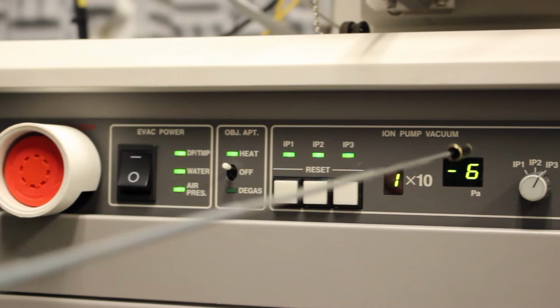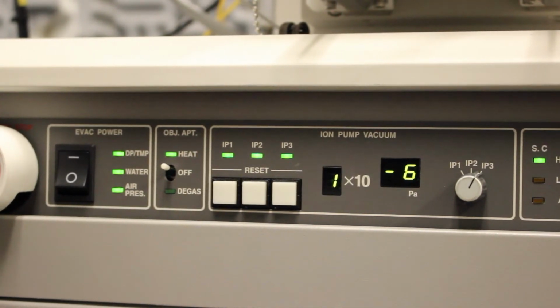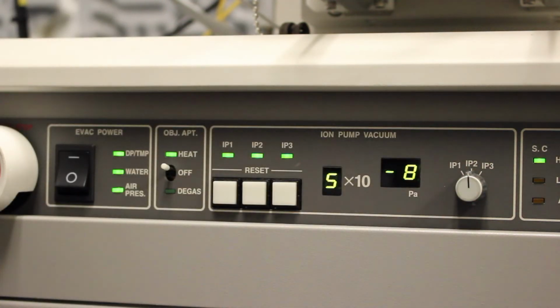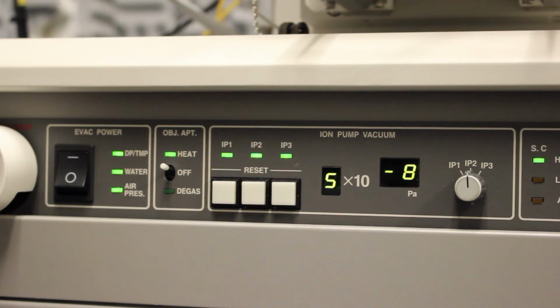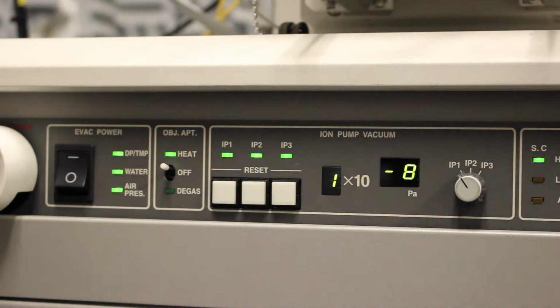Then we check the status of the ion pumps. There are 3 ion pumps. So the typical settings are these: ion pump 3, 10 to the minus 6 pascals. Ion pump 2, 5 times 10 to the minus 8 pascals. And ion pump 1, 10 to the minus 8 pascals.